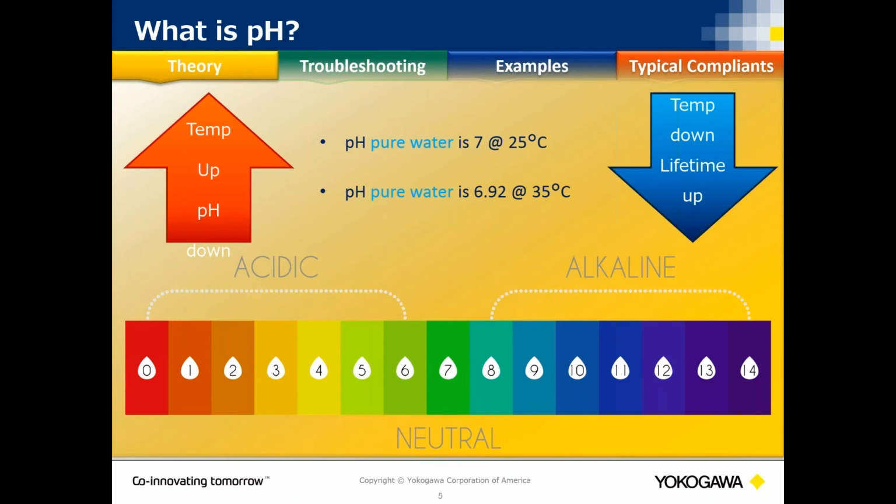Remember, temperature is important to your pH readings for two reasons. There are two different types of temperature compensation. There is the effect on the glass electrode: as the temperature increases, that glass will expand and contract, so it shortens the life of your system. But there's also one called a process temperature coefficient. That means outside of the glass changing, the pH of the sample actually changes with temperature.